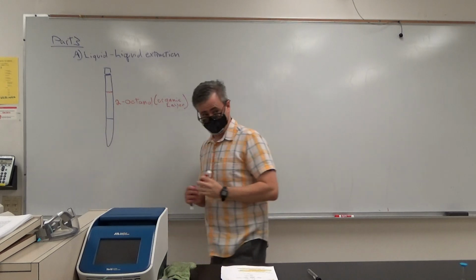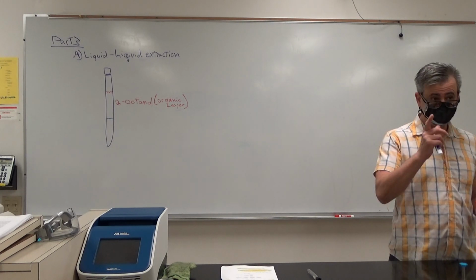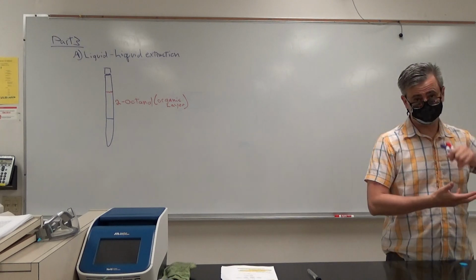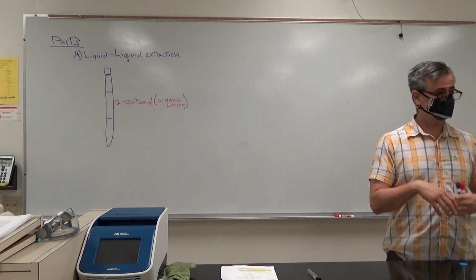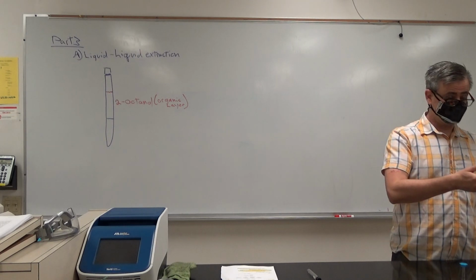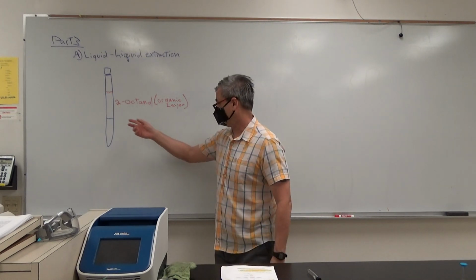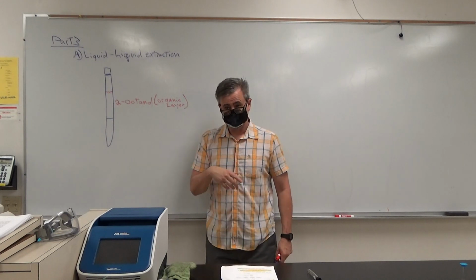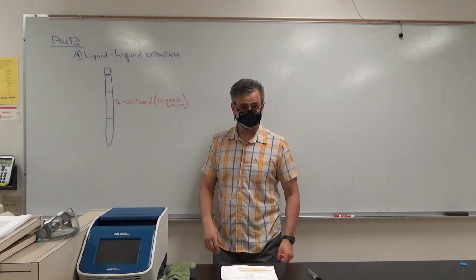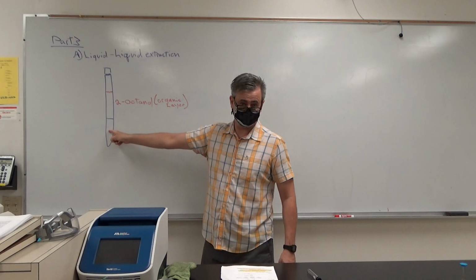All right, and it will always be on top. Most of the time, the organic layer is on top. Not always, though. Actually, we're going to do one fairly soon where the organic layer is on the bottom. But in general, the majority of organic solvents are less dense than water, so the water is on the bottom. All right? And let me take a moment to note that you can't put octanol in these instruments and get a reliable reading. You can only put aqueous solutions in these instruments. So we're going to assess these extractions by examining the aqueous layer. Okay?